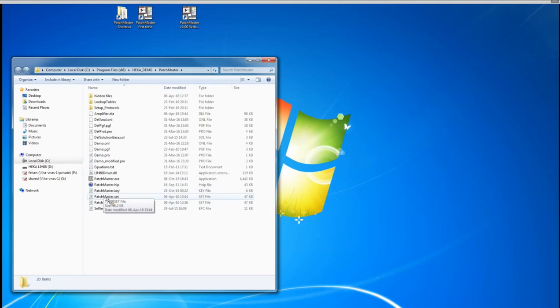And you do this, of course, by either renaming it to anything you want, or this is why I created this hidden files folder here. You can create a folder like this if you want to, and you can just grab it and move it up there, and then it's being hidden. And now if you start PATCHMASTER exe, it will start with the default settings, or it will allow you to start with the default settings.